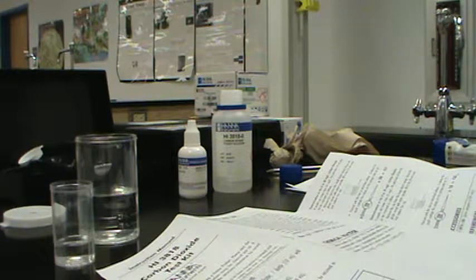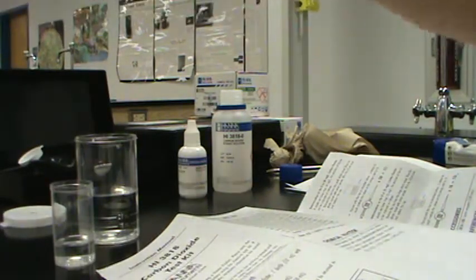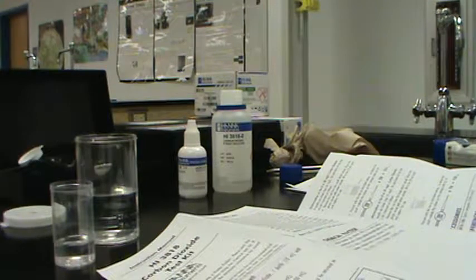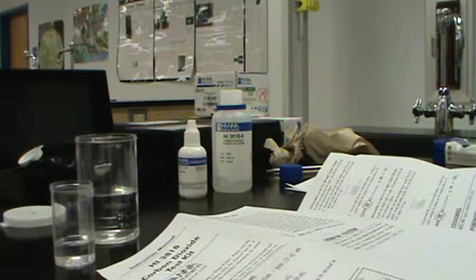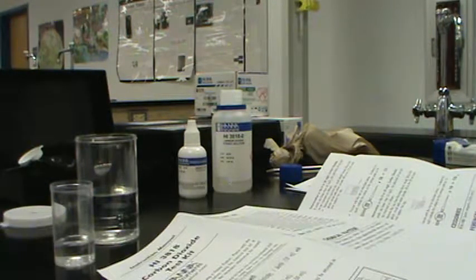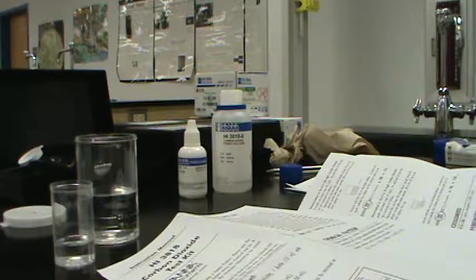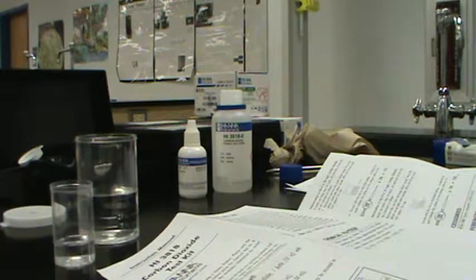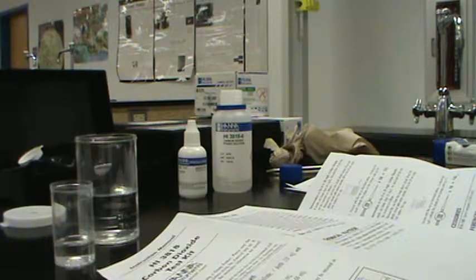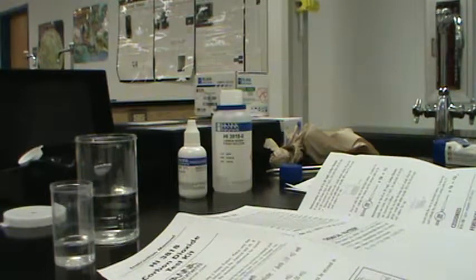This is going to be the final test that we do on our sample of water. As you can see, we're almost out. This is going to be the carbon dioxide test. The other two tests are alkalinity and acidity, and in our previous experiments neither test indicated that the water was either alkaline or acidic in any form, so we're not going to be doing those experiments. We are going to do the carbon dioxide because if you are interested in water quality, carbon dioxide is very important.